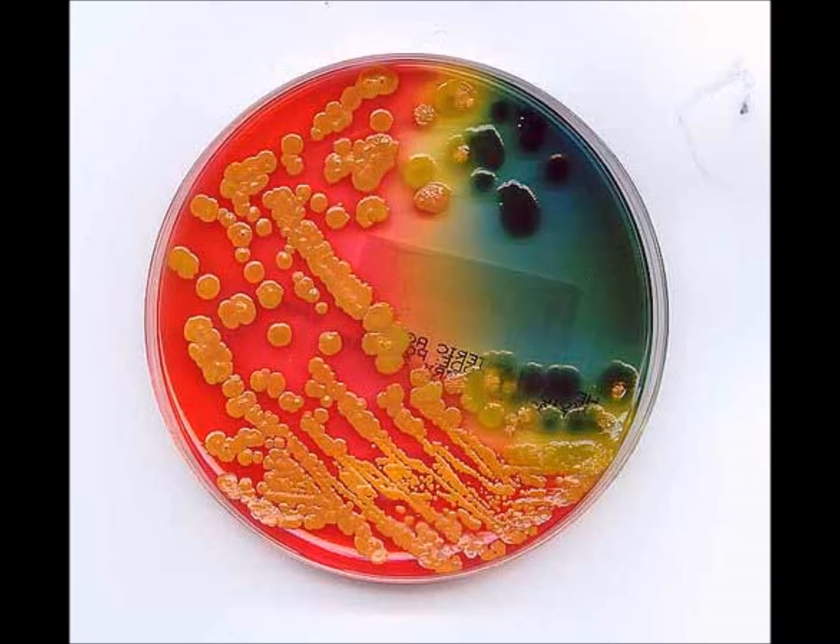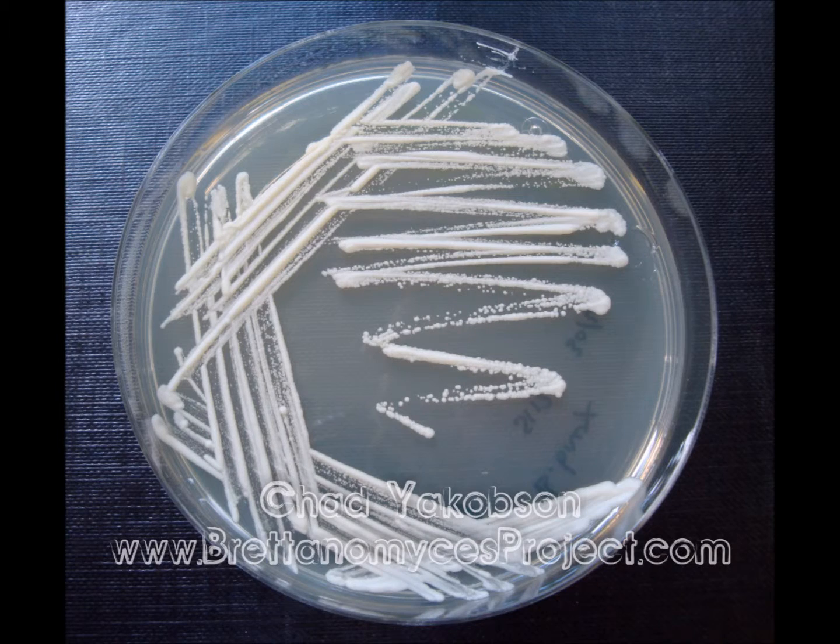The pros, again — it's a simple, easy to use, easy to store product for all ages. This is just your basic agar dish, of course with cultured yeast, and the proper sequencing in order to culture that yeast, which is the zigzags and the form of lines that it is in now.